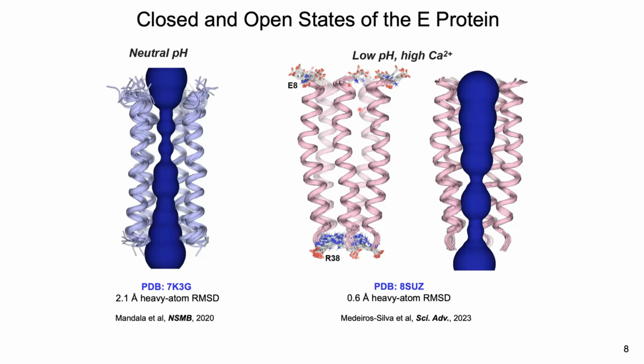And you can see how the 5-helix bundle now looks quite a bit different compared to the closed state structure. Now the N-terminal two-thirds of the transmembrane region is pretty wide and open, looking more like a barrel than a tight helical bundle, while the C-terminal one-third of the protein is a little bit tighter. And there are very interesting features to this, you might call it an alpha helical barrel structure.